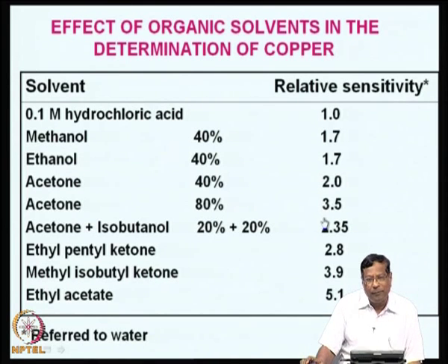That is nice, because you can improve the sensitivity and go to still lower concentrations.